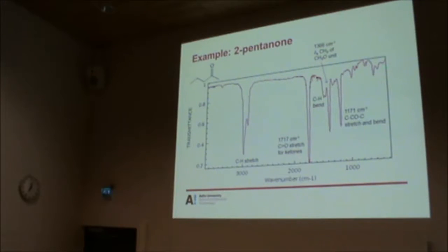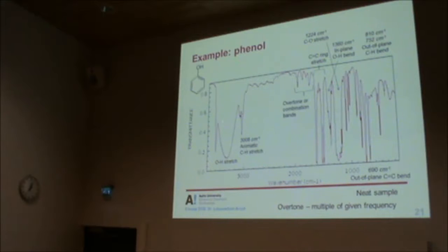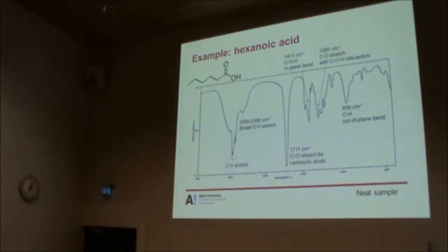This is very important for plant materials because all polysaccharides have a carbonyl group, and that's a C double bond O. So most of your plant samples, you will find a C double bond O if they have polysaccharides. Lignin, when you have lignin, you have aromatic species or unsaturated carbons, then you will find the CC, not ring, but just alkene stretch.